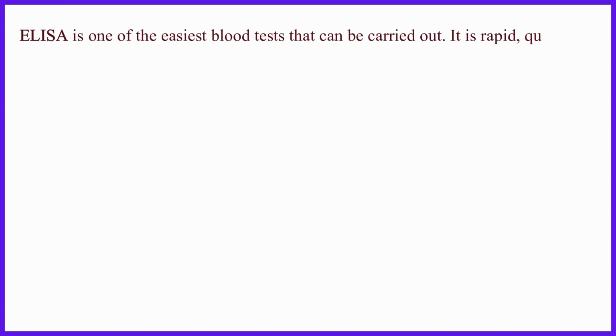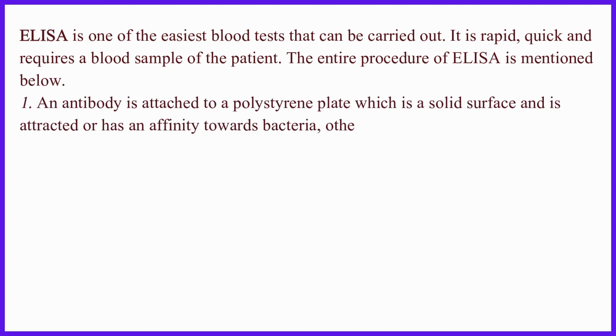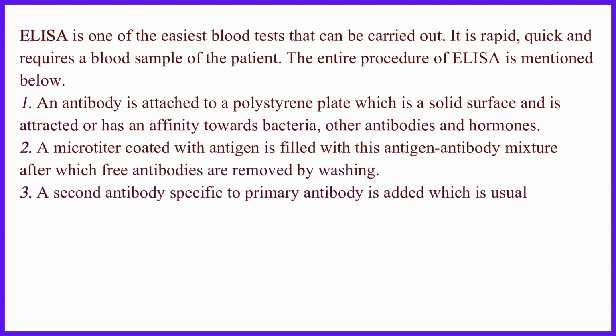ELISA is one of the easiest blood tests that can be carried out. It is rapid, quick and requires a blood sample of the patient. The entire procedure of ELISA is mentioned below.